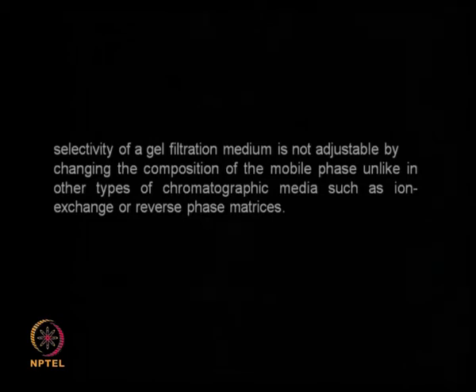So gel filtration is based only on the size, so the interaction happens between the solute and the stationary phase gel. The stationary phase gel means the size of the gel, the porosity of the gel, the pore size of the gel material. So that is a very important difference between gel filtration or gel permeation or size exclusion chromatography vis-a-vis other types of chromatography like ion exchange or reverse phase chromatography.